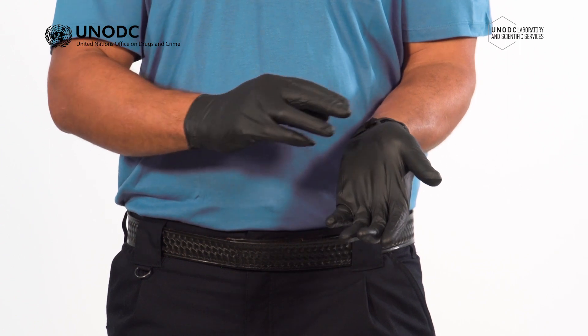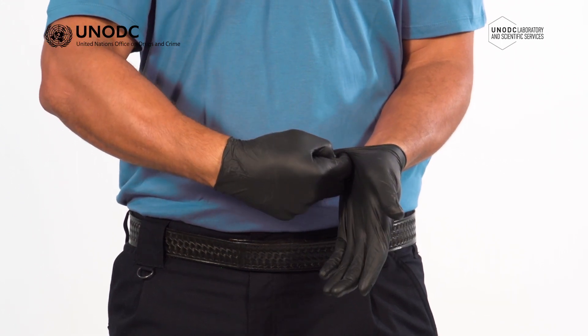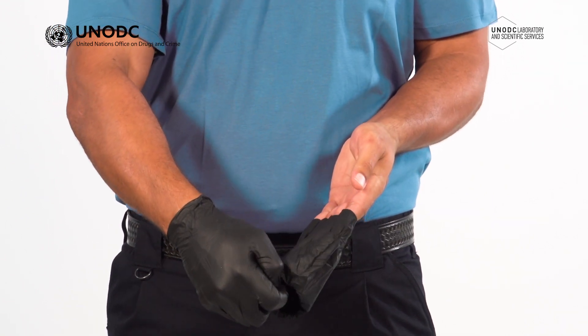To remove the gloves correctly, pinch and hold the outside of one glove at the top of the palm, just below the cuff, and pull it away from the wrist. Curl your fingers under the cuff and pull the glove downward until it is removed from the hand, holding the now inside-out glove bunched in the palm of the remaining gloved hand.